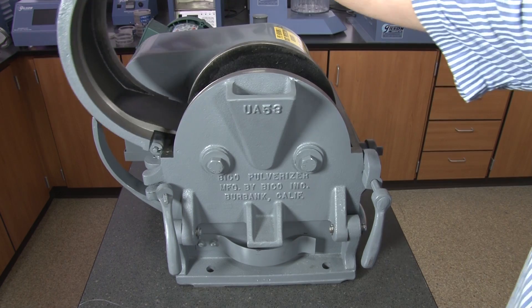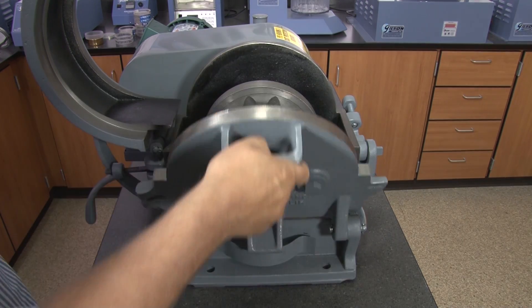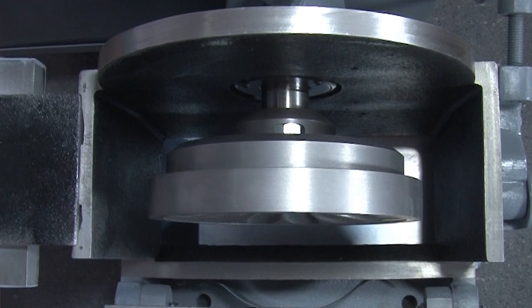The grinding chamber is easily accessible for cleaning and maintenance, as well as allowing the operator to see all processed material to be brushed into the catch pan.